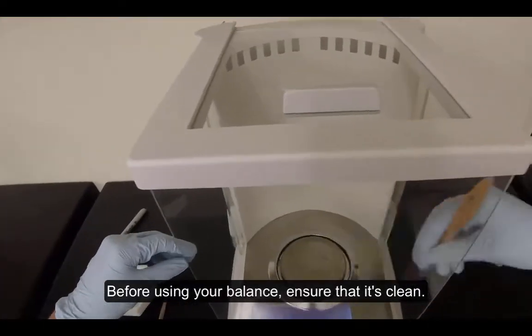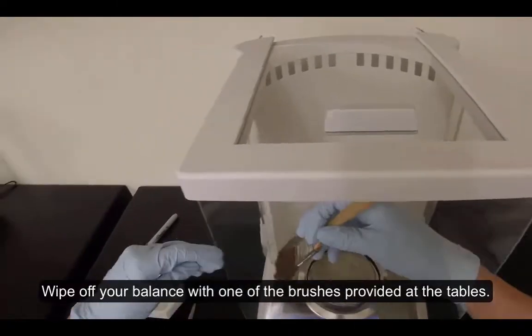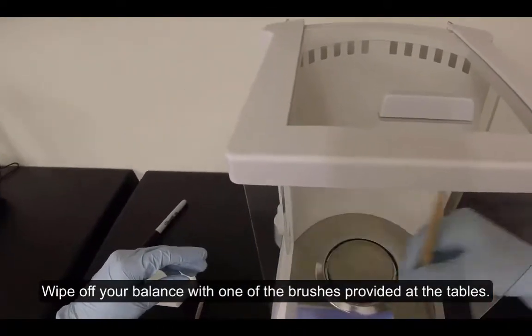Before using your balance, ensure that it's clean. Wipe off your balance with one of the brushes provided at the tables.